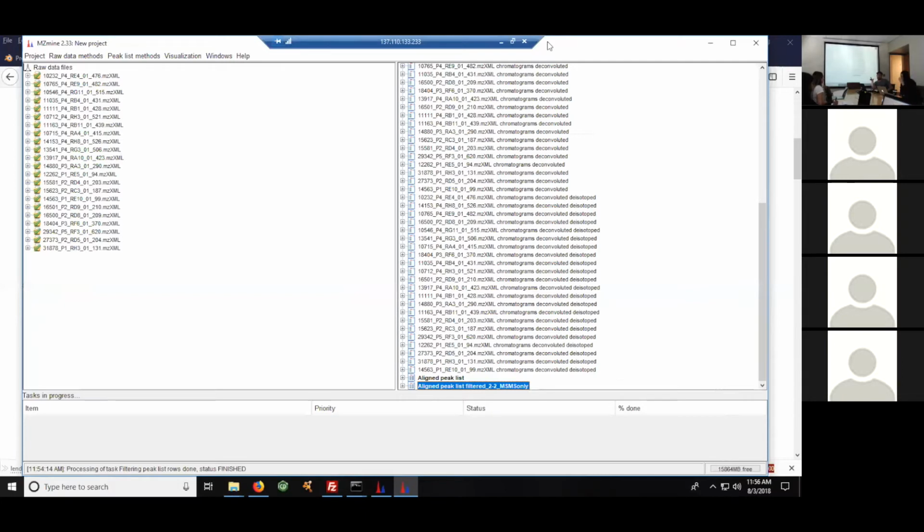The same compound would be in both samples, but it would have been separated into 2 features. So this would be a missed peak or a gap, or sometimes our threshold was too strict and there was a lower abundant compound that we missed.